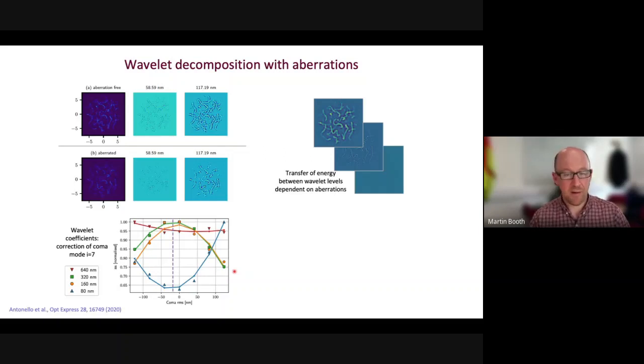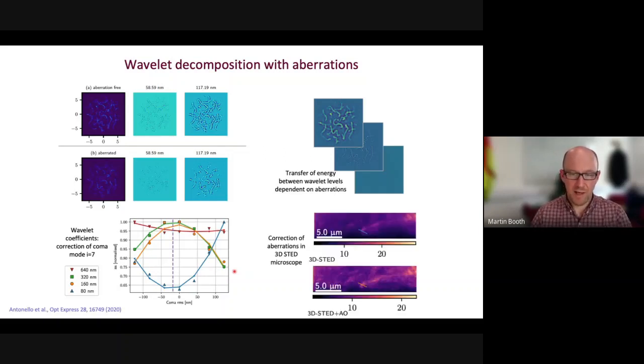And this turned out to be very useful in some forms of microscopes, for example, a super resolution STED microscope here, where depending on how much you tune the resolution of the microscope, you would therefore tune the effect different aberrations have on different effects. So what we learned through this process was that simply choosing an optimization metric like intensity is a bit limited.